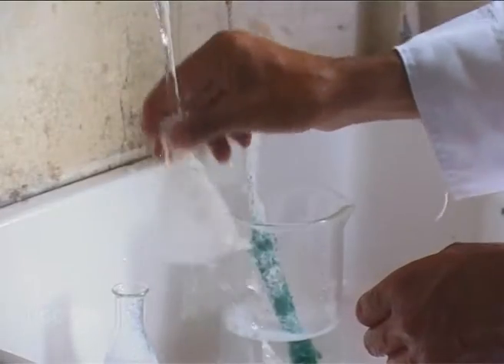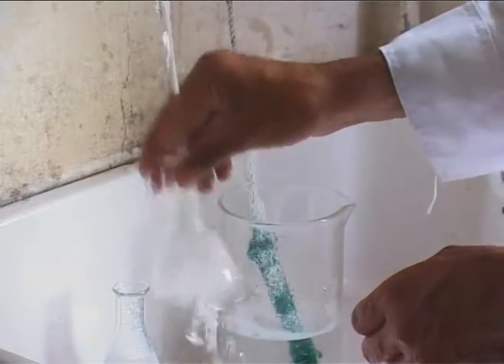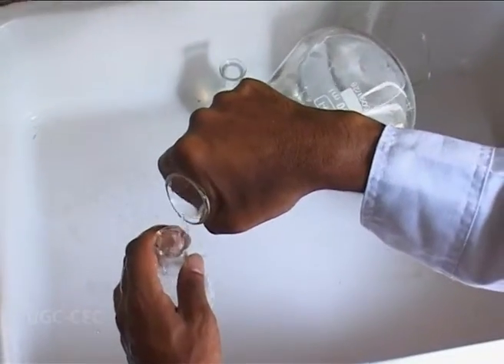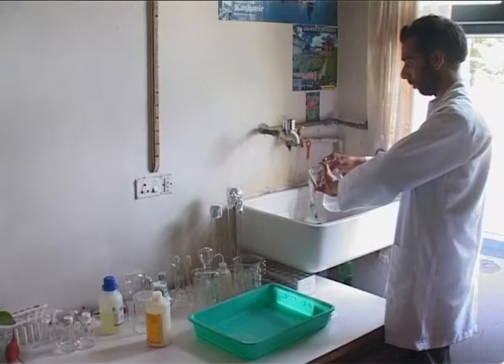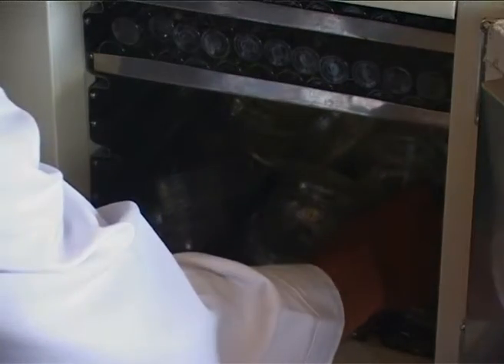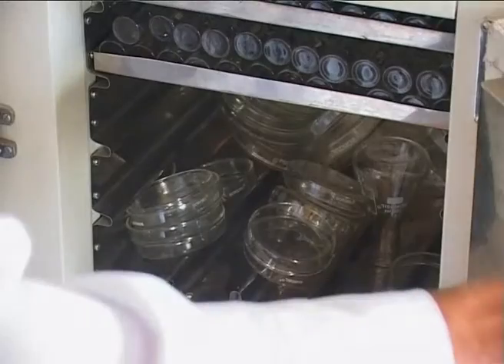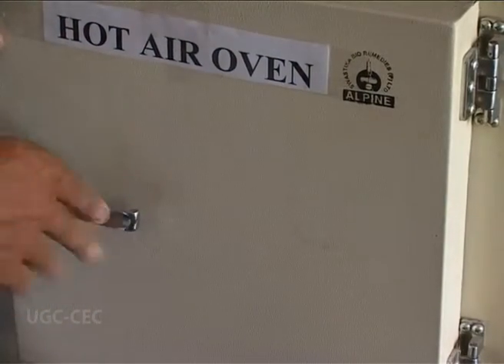Then the glassware is rinsed, first with tap water, followed by washing with double distilled water. After washing the glassware, it is placed in trays. Finally, the glassware is dried in an oven at a temperature of 75 degrees Celsius.